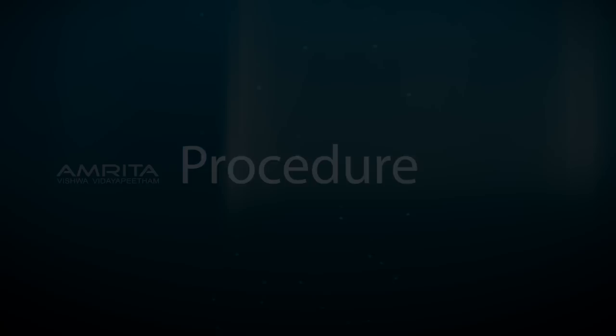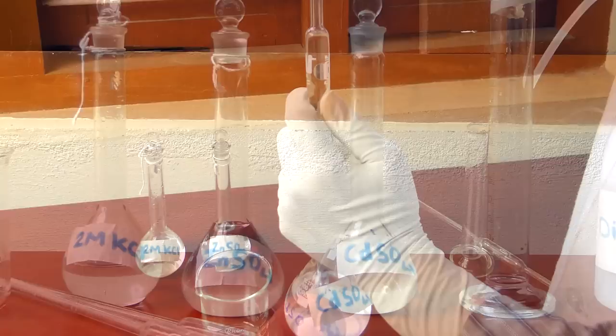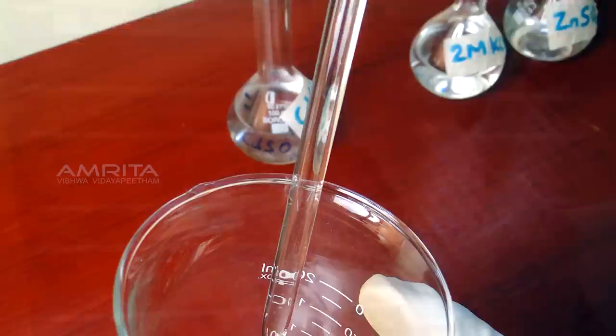Procedure: Arrange all the required materials on the table. Pipette 10 ml of 1 mmol cadmium sulfate solution into the 250 ml beaker.